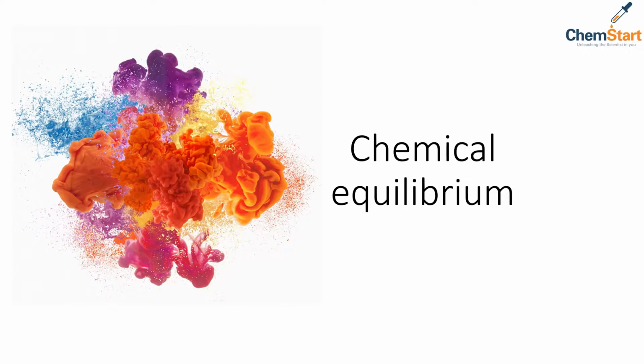Hi, young scientists. In the reaction we will perform today, we will look at the effect of changing the concentration of the reactants and products, as well as changing temperature and what effect that has on equilibrium. If you have your ChemStart kit with you, you will be able to follow along and do the experiment yourself as well. We will use the cobalt chloride solution for this investigation. Stay tuned.